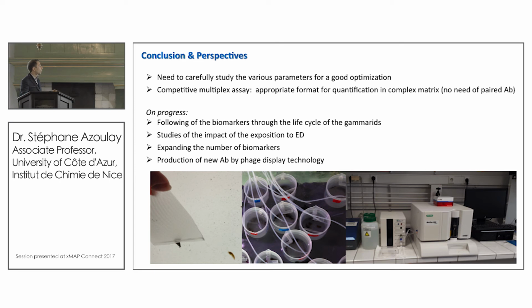To conclude, if you want to develop a Luminex assay, you have to pay very careful attention to all of the parameters. It was the first time that we used this technology.